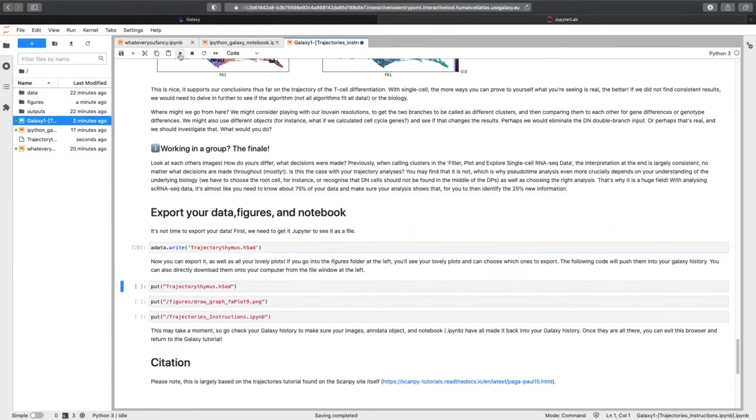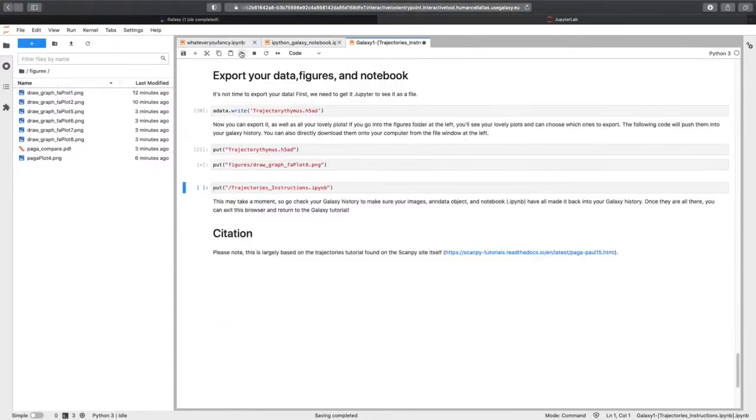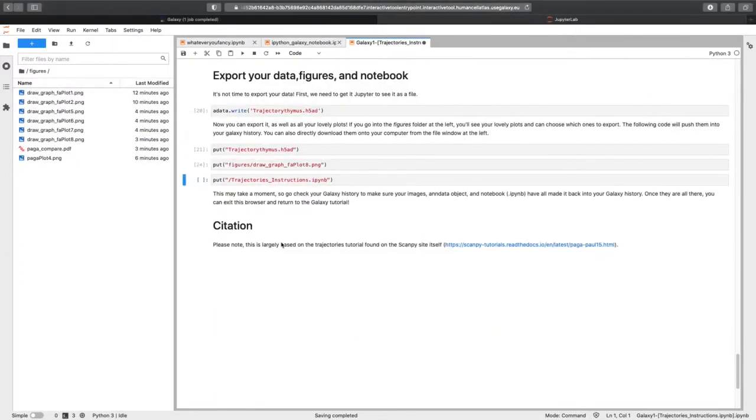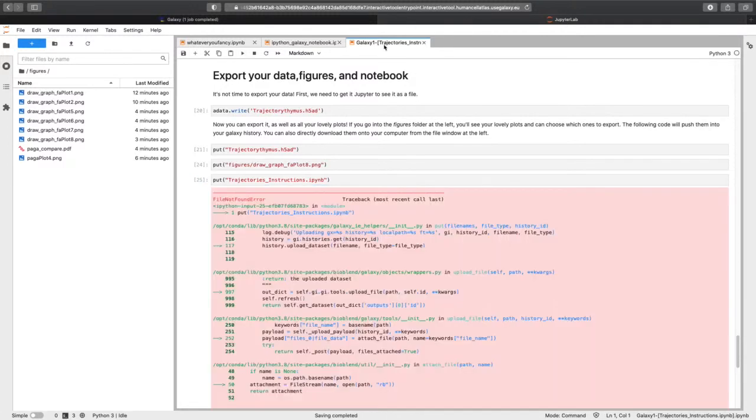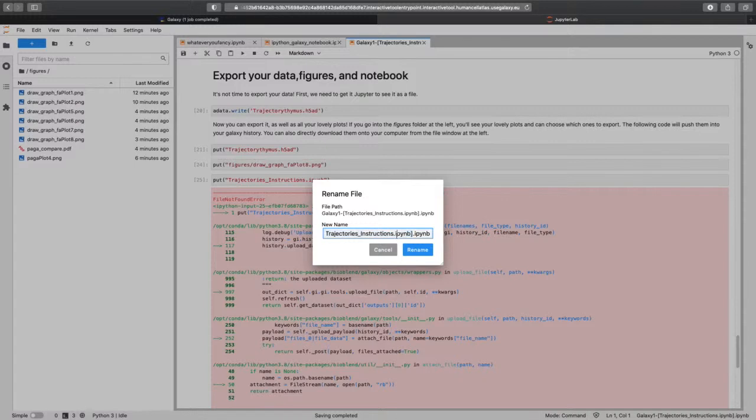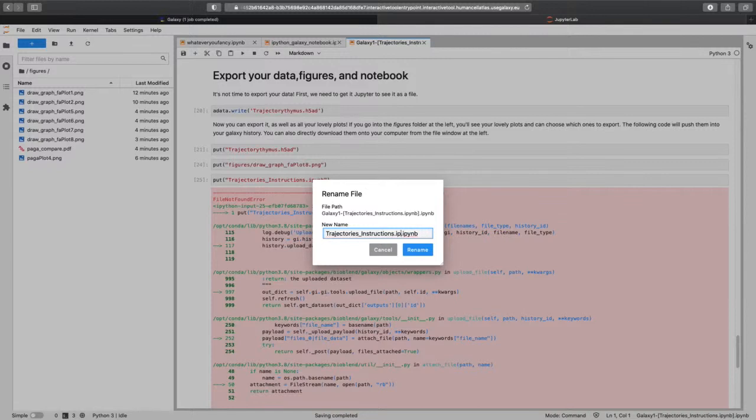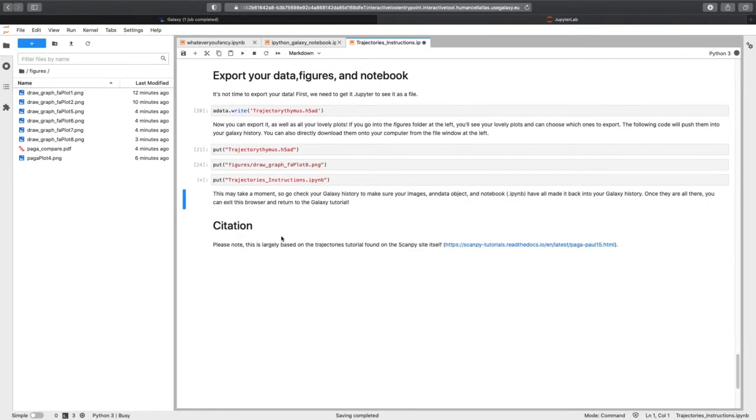And then now we're putting those objects into our Galaxy history. And sorted flawlessly. Okay.